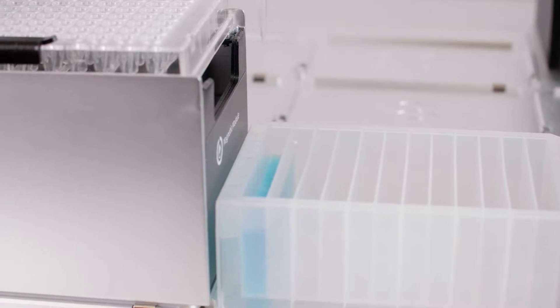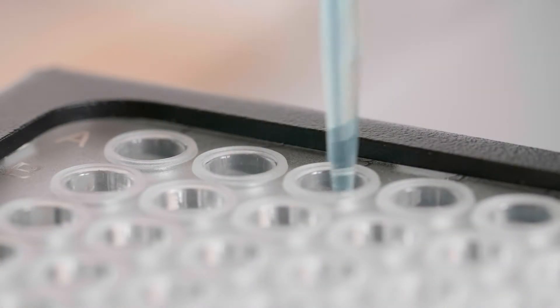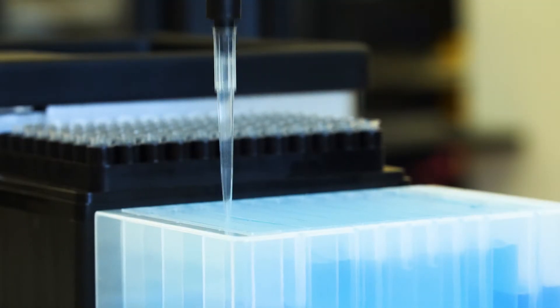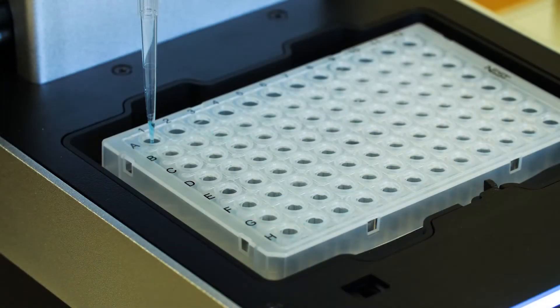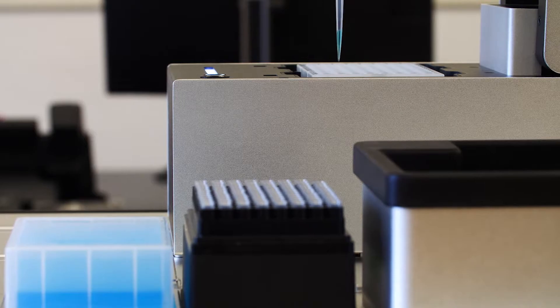With these modules you can increase the functionality of your OT2 so that it can automate full protocols requiring temperature control and magnetic beads. There's also our automated on-deck thermocycler for PCR based experiments. It's integrated directly with the OT2's API and can be programmed either in Python or with our easy-to-use protocol designer tool.